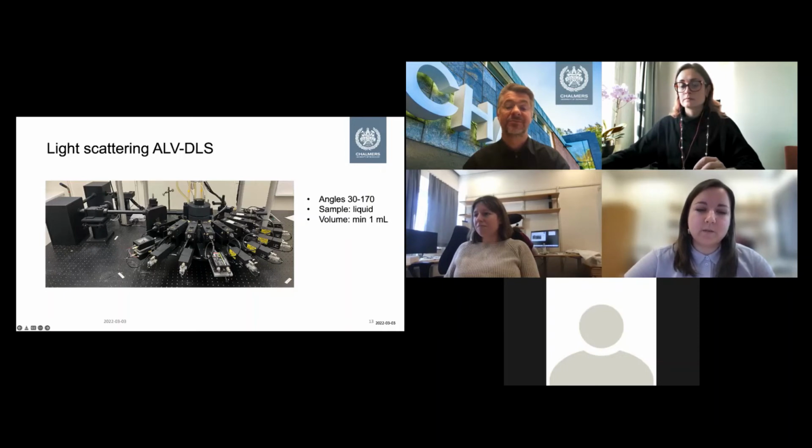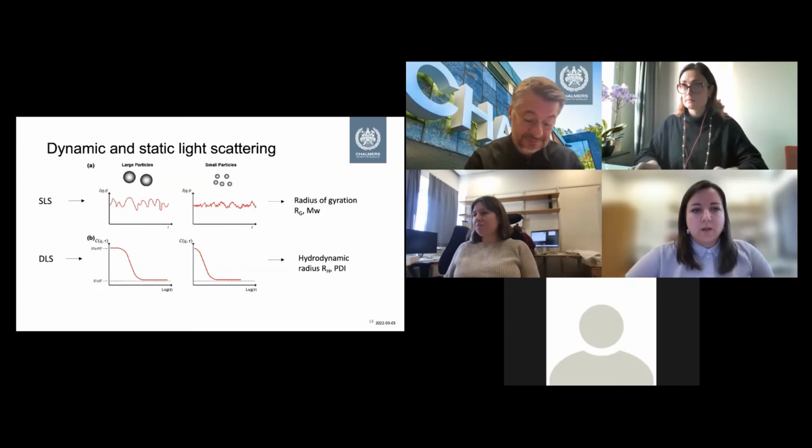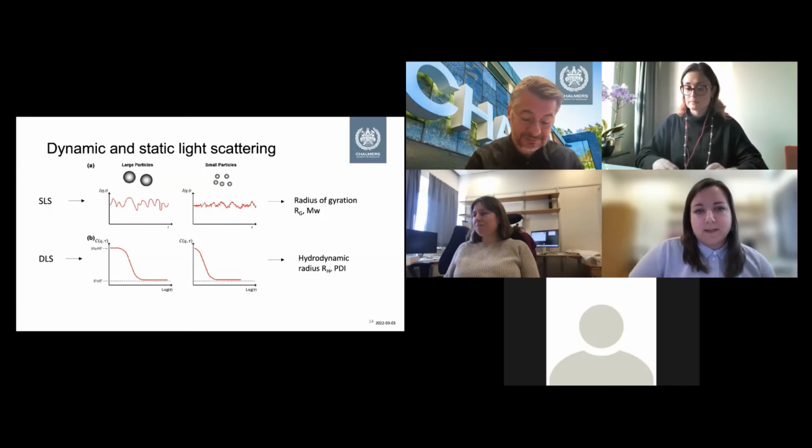However, in this case, you would need a little bit larger amount of sample, at least 1 milliliter of your solution, depending on the concentration of your sample. So what are dynamic and static light scattering, or what kind of information can you get from these techniques?